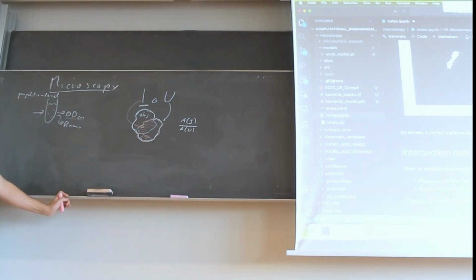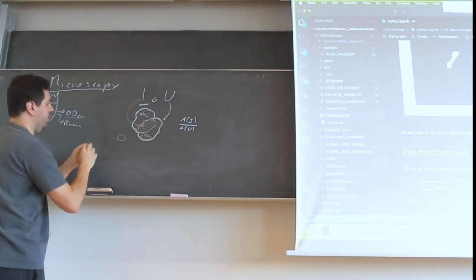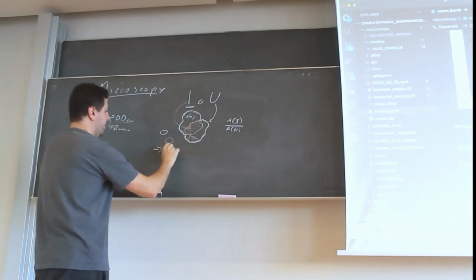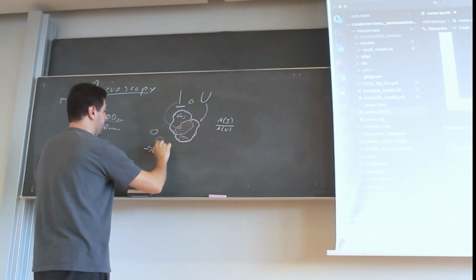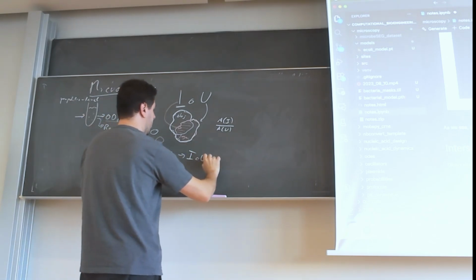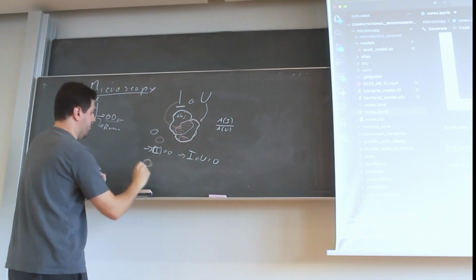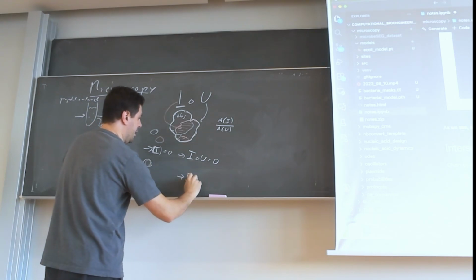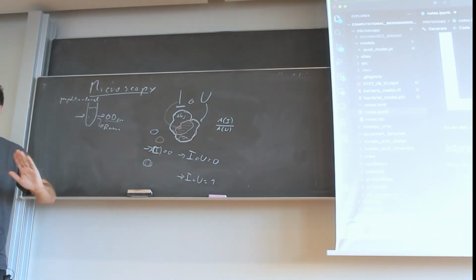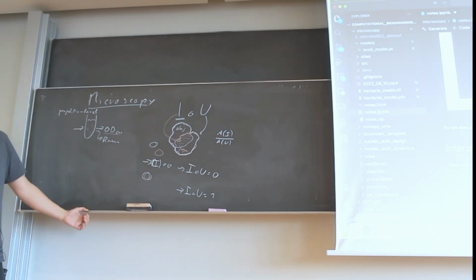It is not too difficult to see that, for example, in the case that you have this here and here, the area of the intersection would be 0. So actually, your IOU would be 0. Or in the perfect match, you would have an IOU of 1. And this gives you a very nice measure between 0 and 1 of the quality of your segmentation.